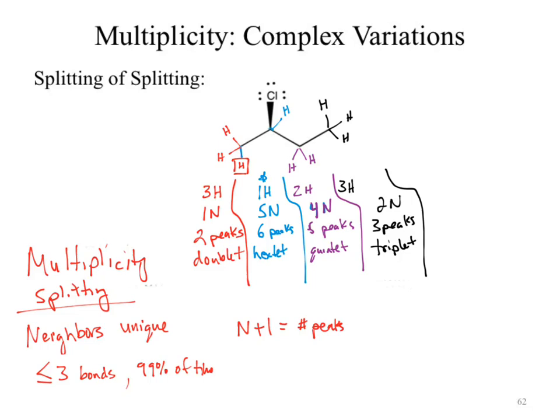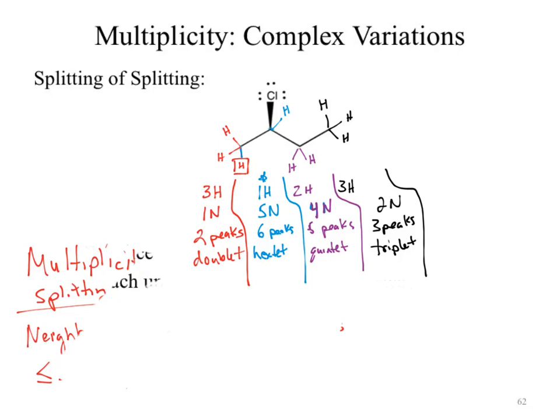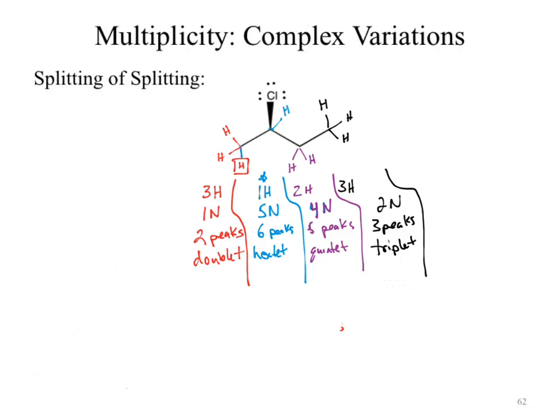We'll start with our blue hydrogen. This is what we would expect to see, or what we would probably see in our spectra, exactly what's written up here. The theoretical spectra becomes a lot more complicated. I did not want to erase that. Thank goodness I have an undo. So what do we end up having to do? Let's take a look at the blue one and what's actually happening. So, theoretical.